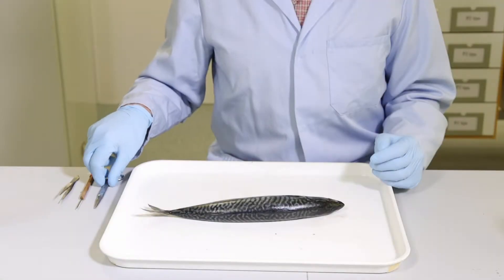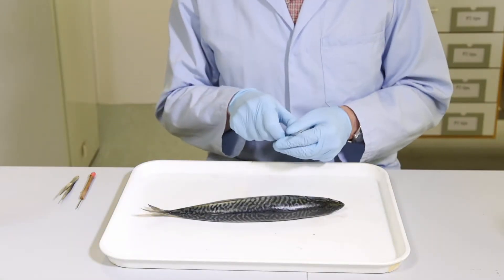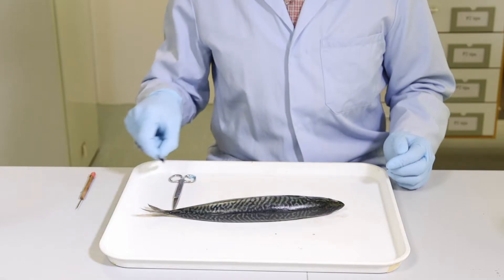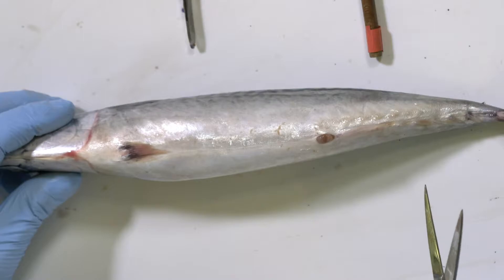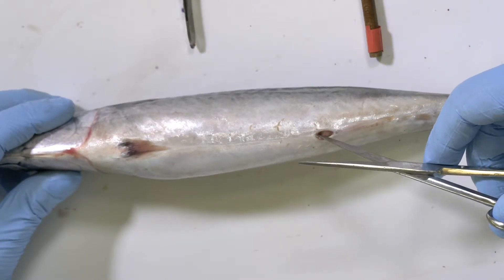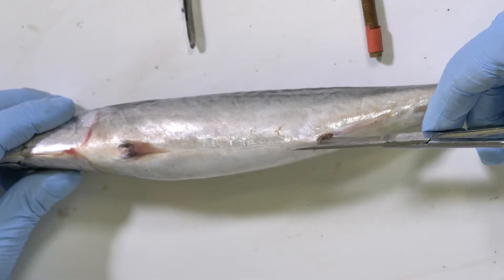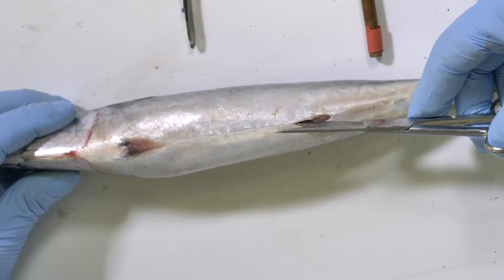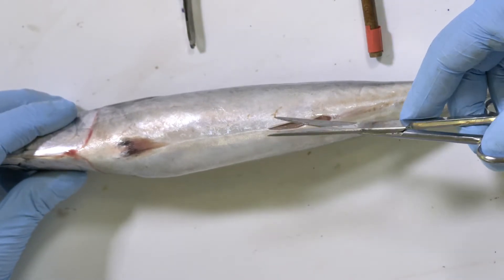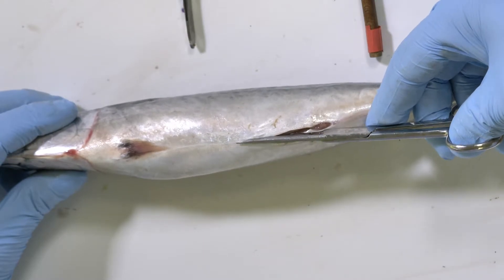In order to open the fish up you need some simple tools — scissors, forceps, and a mounted needle. Taking scissors, insert the point of the scissors into the anal pore and begin snipping through the body wall along a line, midline towards the head.